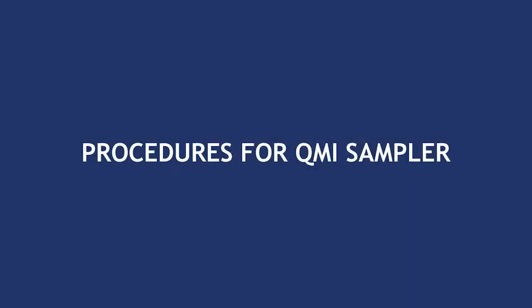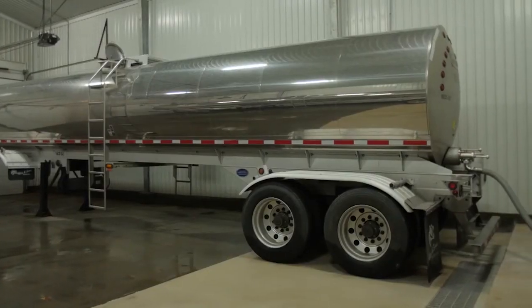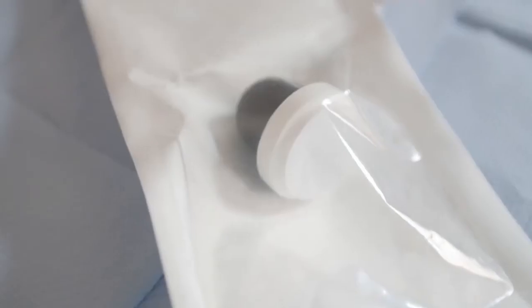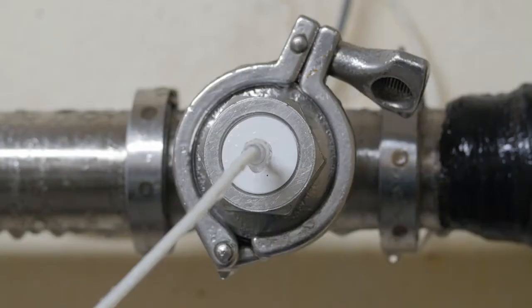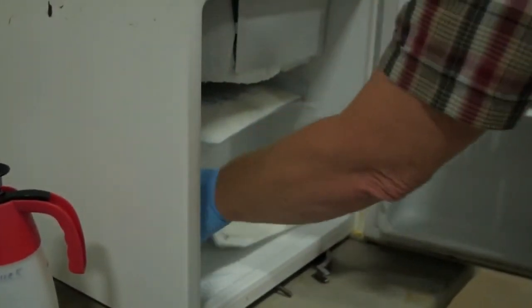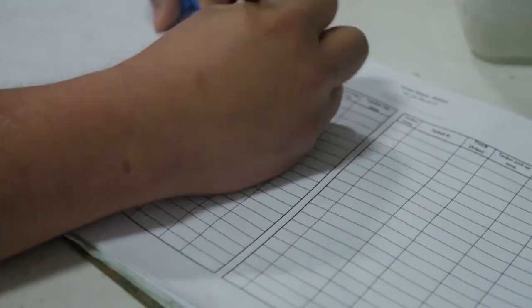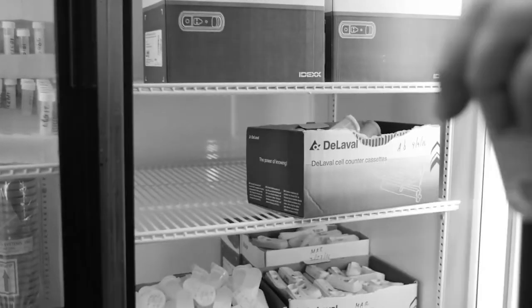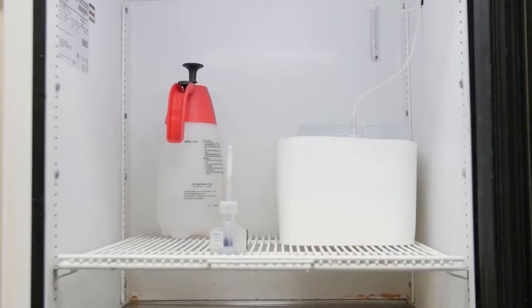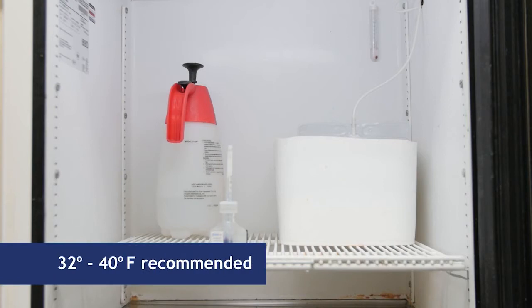Now let's discuss how to properly use a QMI inline sampler. The QMI device is to be installed in an appropriate location in the milk line to ensure accurate sampling and proper cleaning. The white protective septum cover should be in place at all times. Two refrigerators are necessary: one for sample collection and one for sample storage. Record the temperatures for each refrigerator twice a day, both morning and night. Only use these refrigerators to collect and store milk samples. No food, beverages, antibiotics, chemicals, drugs, or any other items not related to the samples or sampling procedures may be stored in this refrigerator.